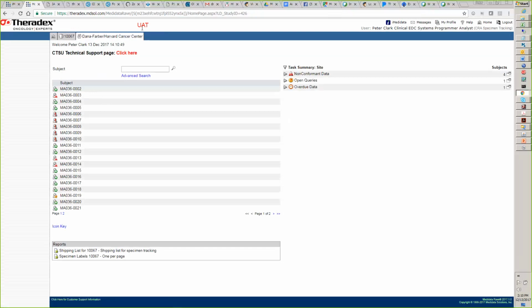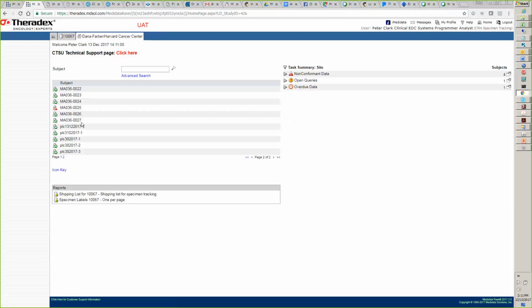So here in the UAT environment, it's taking me into the Dana-Farber test site. The patient that we're going to work with today is patient 27, and I've already done data entry for this patient.